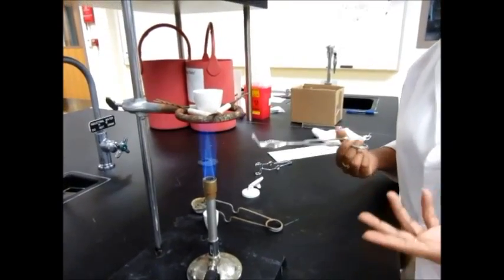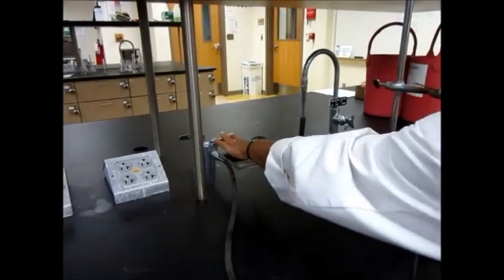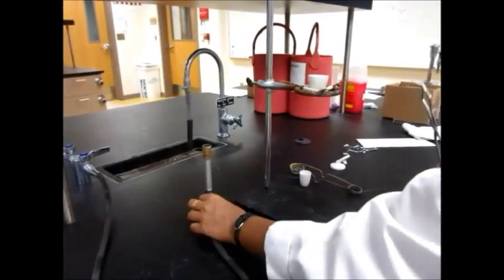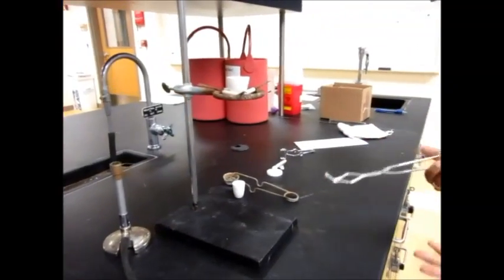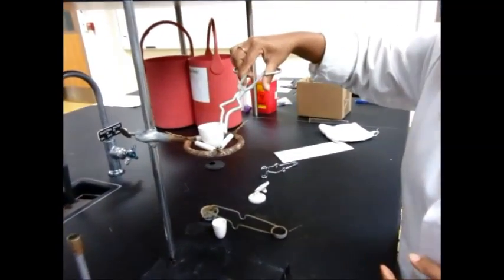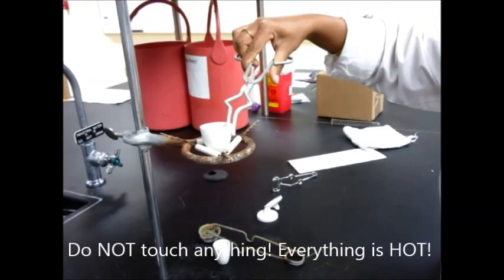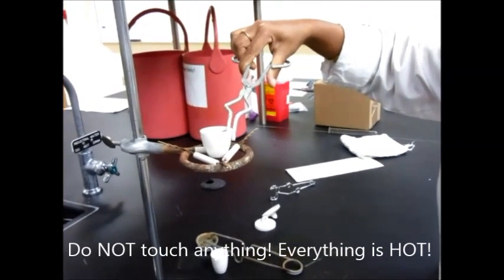When you're done heating for the five minutes, seven minutes that you're required to, at that point go ahead and turn off the Bunsen burner. Remove it and let the crucible cool like this for a while. Or what you can also do is remove the crucible and hold it like this very carefully. Do not touch anything with your hand at this point because everything is hot.